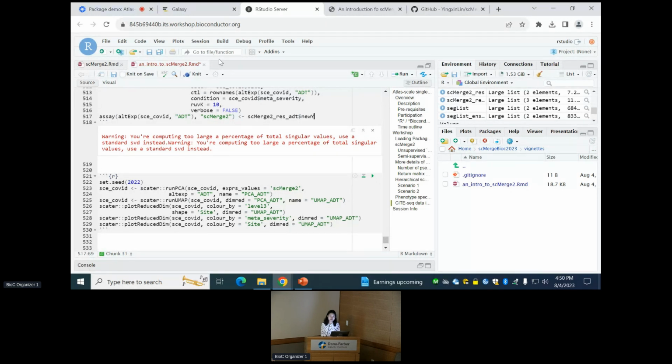So you mean doing it at large scale? Like if you're trying to use a data set of 50 different PBMC batches, and have you tried replicating that 50 times, and then seeing the same performance going through these merges? She does a 20 data set thing with however many million cells. Oh yeah, that's atlas scale, I guess.